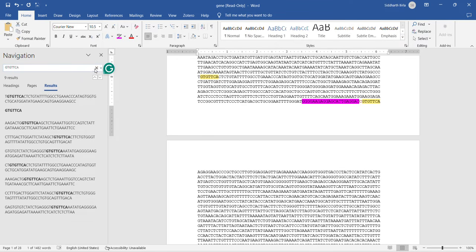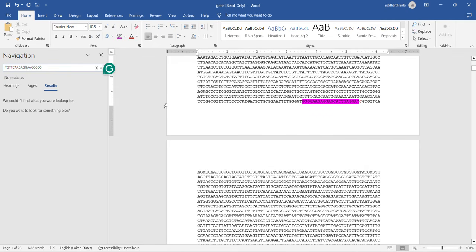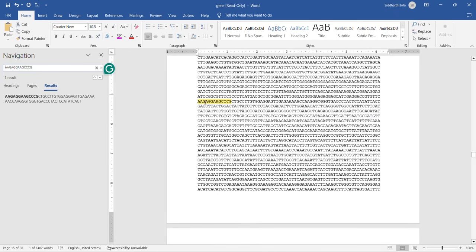So that is one confirmation that what we have selected is correct. Again I'll paste it and I'll try to delete it from this side. So if I delete it from this side, near to this red marked C, right? If I delete it after 6 or 7 bases, it will highlight the next line.